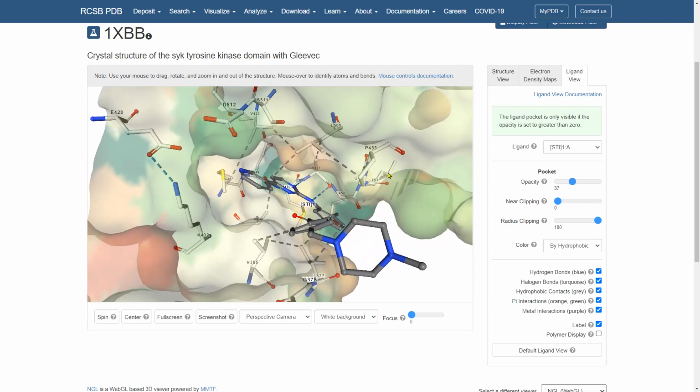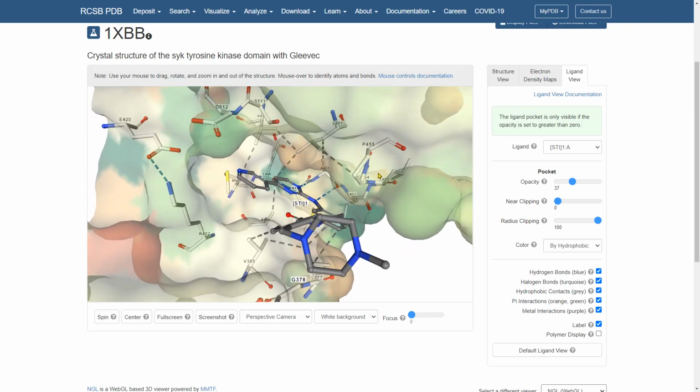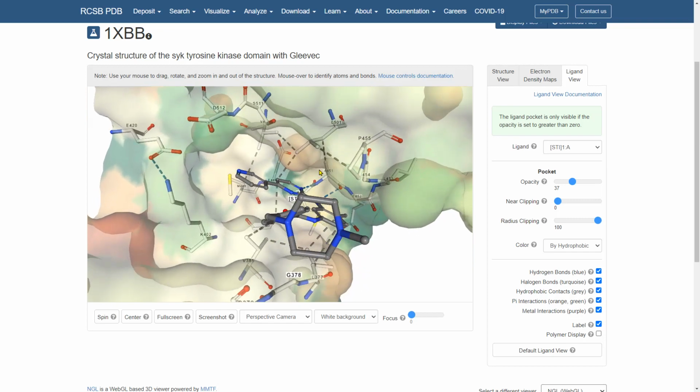We can see exactly how the drug fits into the pocket. We can also make some predictions on where more groups might be added to further improve binding. Maybe another methyl group over here could help binding. Hopefully you can see how incredibly informative and helpful this type of structural information could be in guiding the drug discovery group.